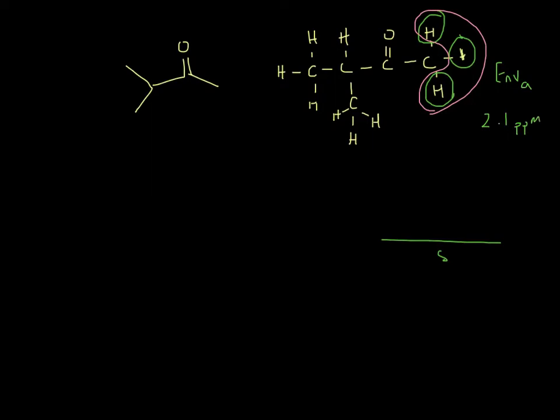All right, but again, those hydrogens don't know each other, so if we think about where they're going to appear, one's going to appear right here at 2.1. The second one's going to appear right on top of it at 2.1. The third one's going to be exactly the same. So basically you have three peaks that appear exactly on top of each other. That might seem silly, but it'll be very important. We'll get to that shortly.